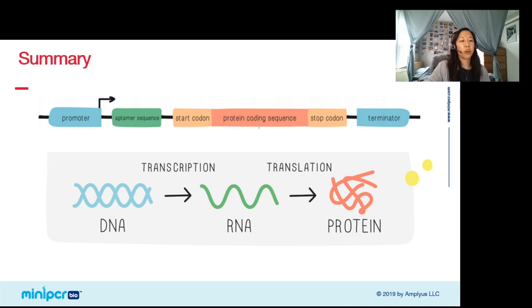You also got to learn different ways this system can be broken. As you saw in tubes 3 and 4, if any parts of the molecular machinery, like the ribosomes in tube 3, aren't working, then this process doesn't work. And similarly, in tube 4, if any part of the gene structure is missing or incorrect, it would also not work. Overall, I hope this was clear that this was a really easy lab to do.